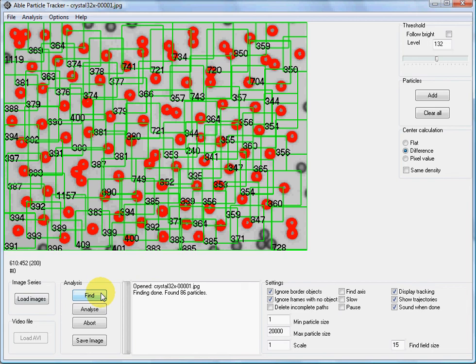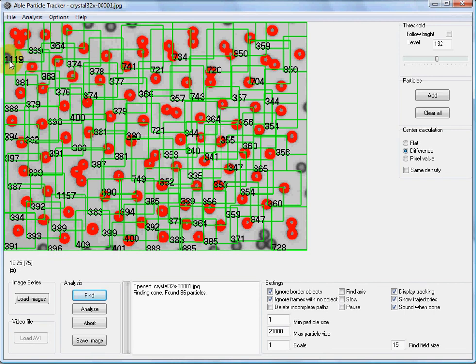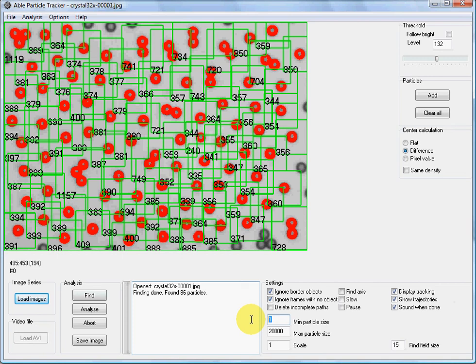As you can see, the application has marked the particles. The sizes are around 300 to 400 for single particles, around 700 for doublets, and around 1100 for triplets. So the proper size, if you want to track only single particles, would be somewhere between 300 and 500.